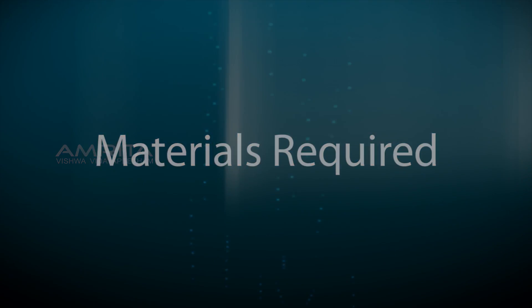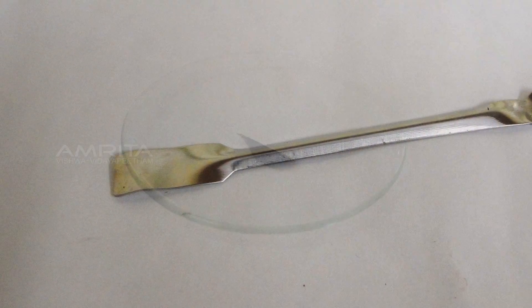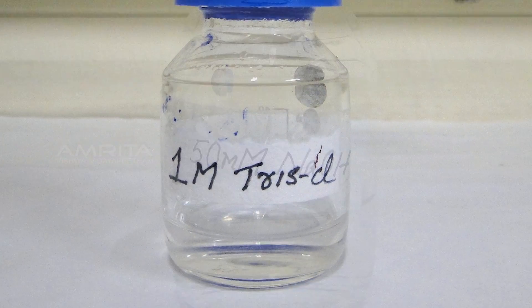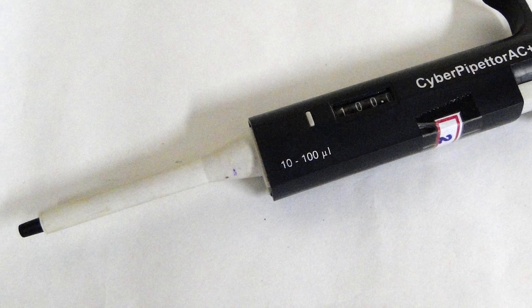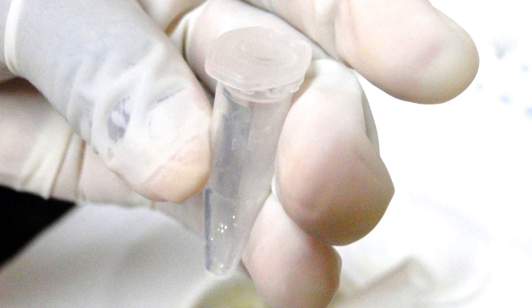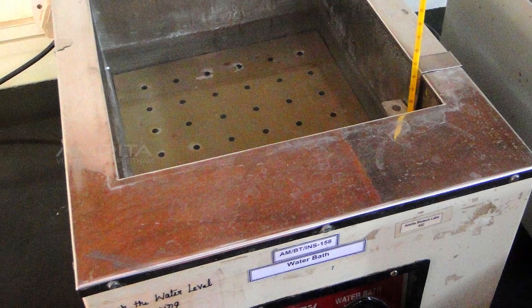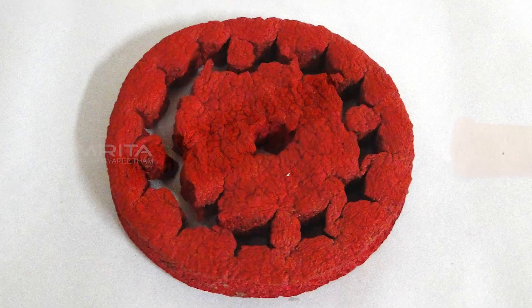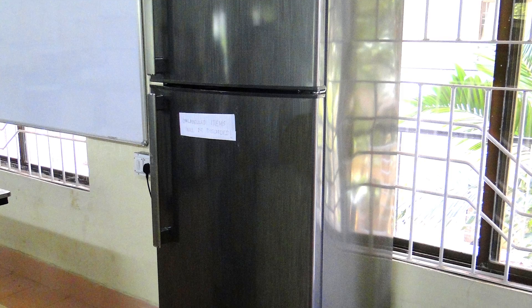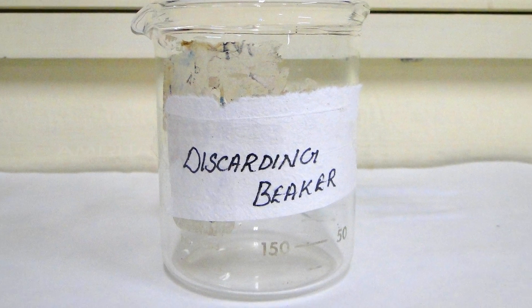Materials required: fish fin placed in a watch glass, spatula, 50 mM NaOH solution, 1 molar Tris HCl, micro pipette, pipette tips, 1.5 ml microfuge tubes, mortar and pestle, water bath, floater, syringe, centrifuge, 4 degree Celsius freezer, minus 20 degree Celsius freezer, and discarding beaker.